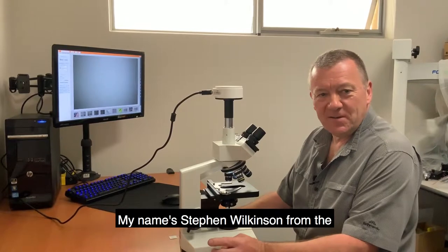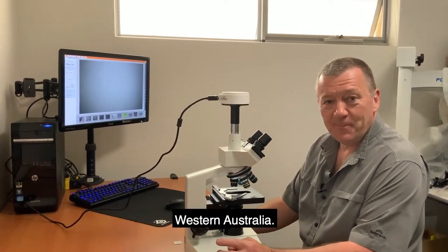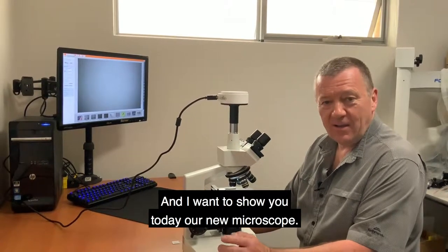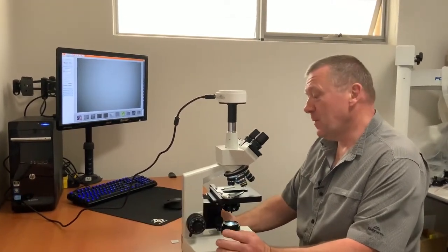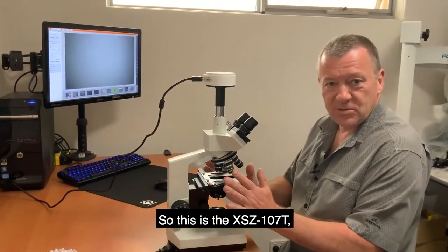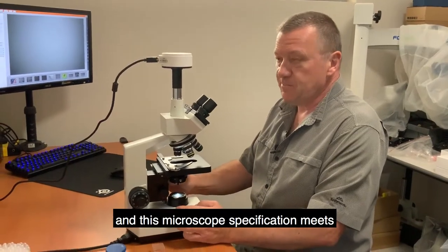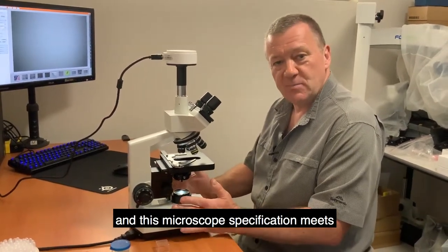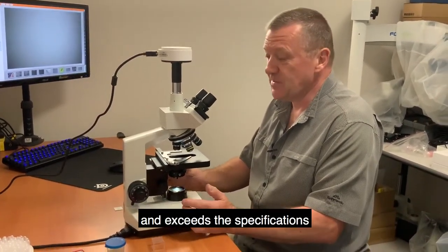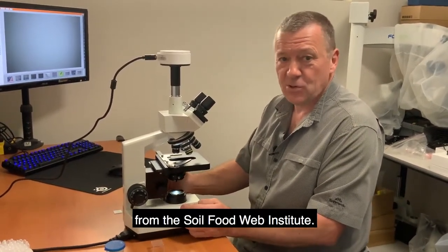Hello, my name is Stephen Wilkinson from the Compost Tea Brewing Company in Perth, Western Australia. I want to show you today our new microscope — the XSZ107T. This microscope meets and exceeds the specifications as set out by Dr. Elaine Ingham from the Soil Food Web Institute.